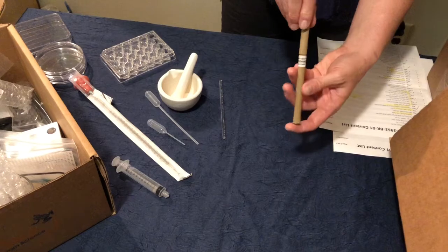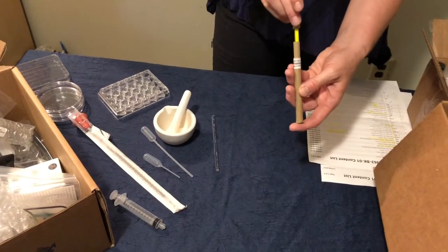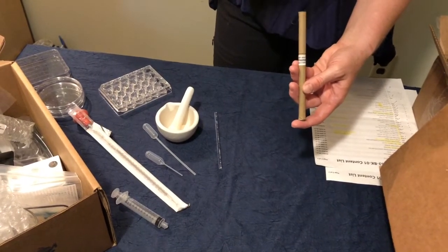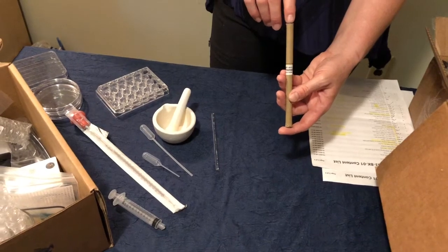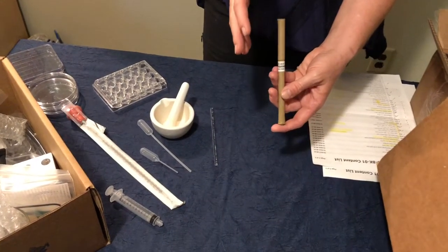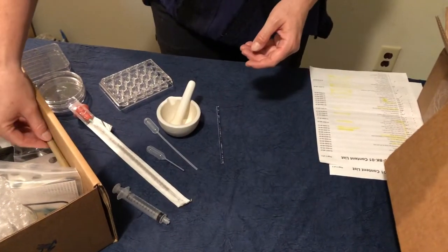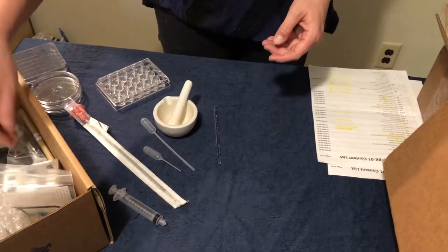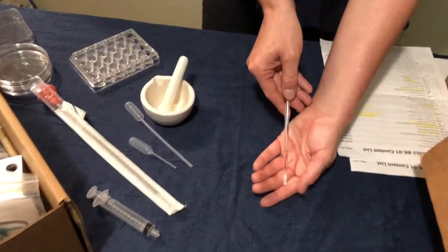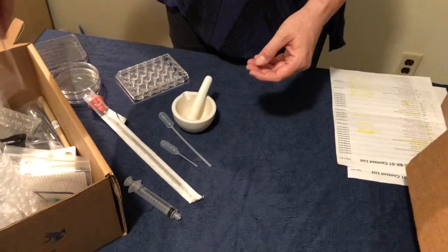This little brown container is easy to overlook — this is our thermometer. The student supplies list calls for an analog or digital thermometer. This one measures in degrees Celsius but doesn't have a lot of tick marks, so it won't be highly accurate. If you happen to have an analog or digital thermometer around your house, you can use that, or you can purchase one fairly cheaply for under $5. Also, dig around inside your kit for the stirring rod — it's often challenging to find because it's so clear and small. Make sure it is not broken.